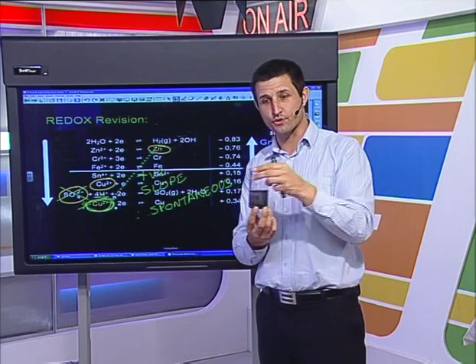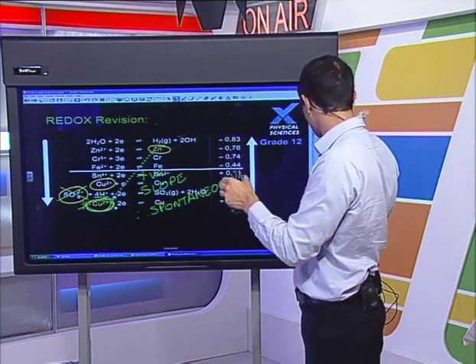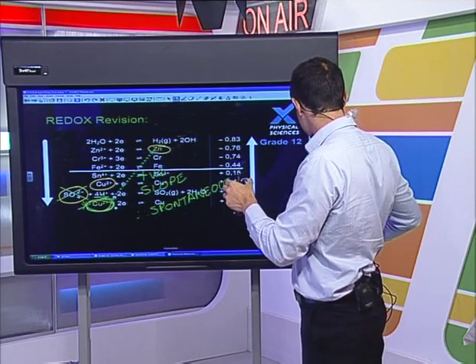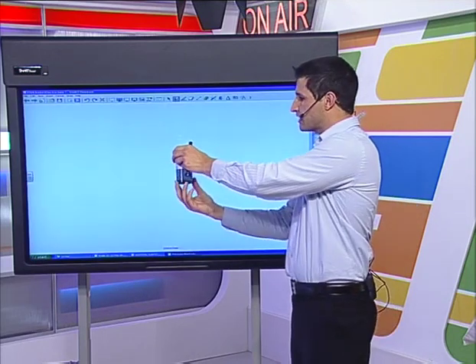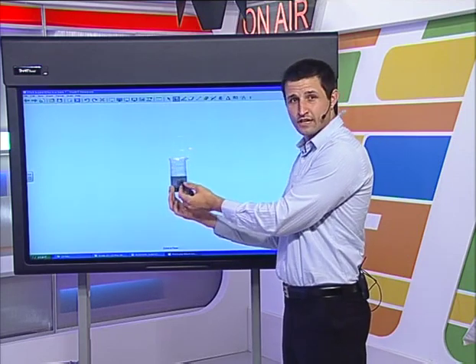Remember that this was blue. What we actually notice, and let's bring this up in front of something blue. Okay, there we go. Let's make a nice white background. You can actually see that the blue color has gone out of this. This was a very nice, lovely blue color.